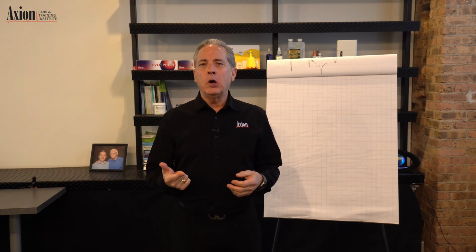So it's time to unveil more mysteries to you in the HPLC world. Today we're going to talk about some more specifics of your stationary phase, and that is things like the surface area and the carbon load. If you've never heard those terms, this is a really important talk because this will give you some of the specifics, what makes one C18 column different than another.